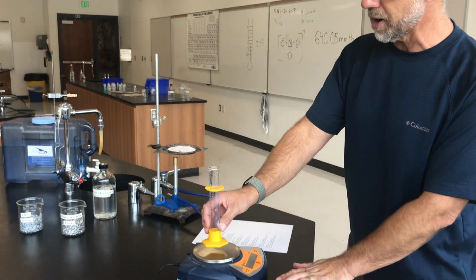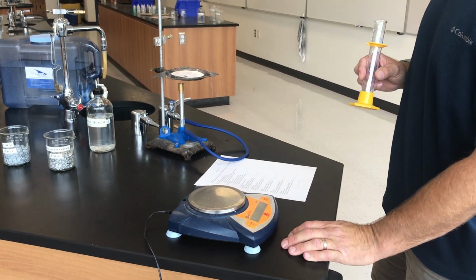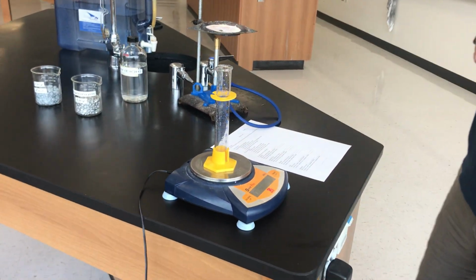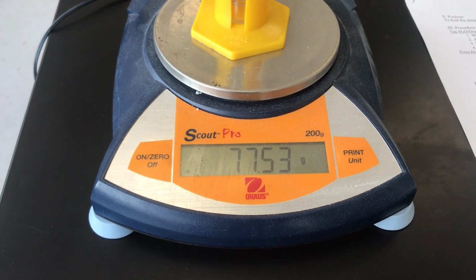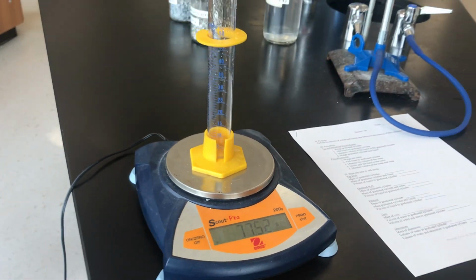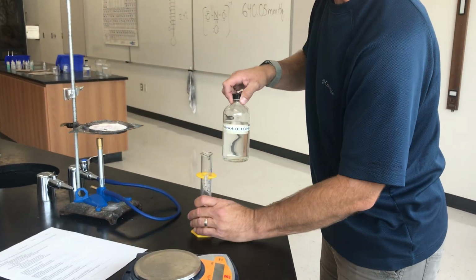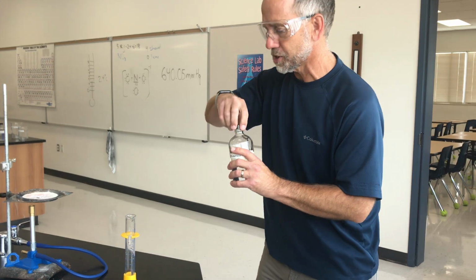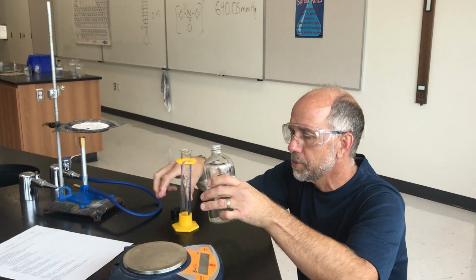Again, we will re-zero. Oops, didn't quite re-zero there. Re-zero the balance. Again, measuring the mass of the graduated cylinder empty. And this time we'll be adding ethanol. Ethanol is actually the alcohol that we use for hand sanitizer. And we will get a sample of ethanol.